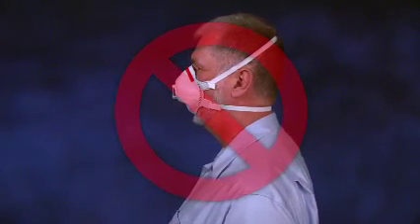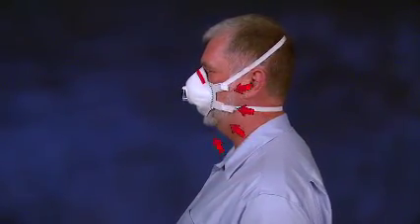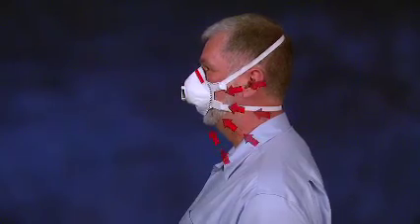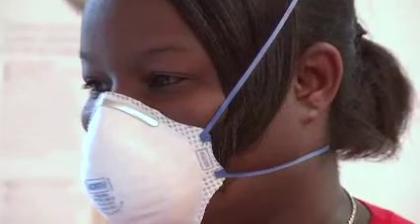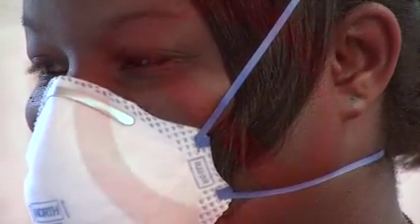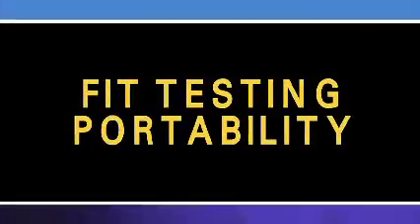Facial hair, like a beard or mustache, can affect your respirator's ability to protect you. Anything that comes between your face and the respirator's seal or gets into the respirator's valves can allow contaminated air to leak into the respirator facepiece, and you will not be protected. For example, if you have long hair, make sure it doesn't get between the respirator seal and your face, because this can allow contaminated air to leak into the respirator.